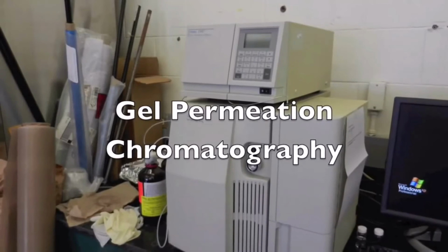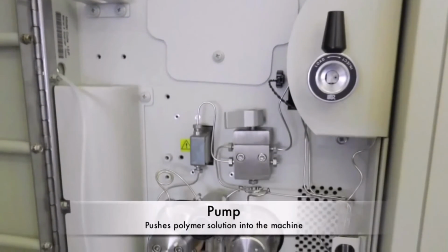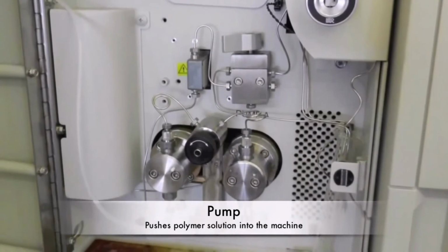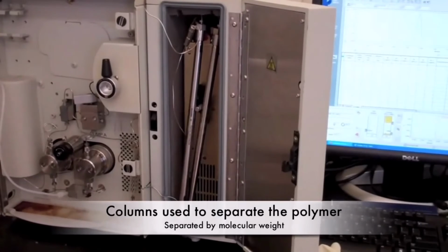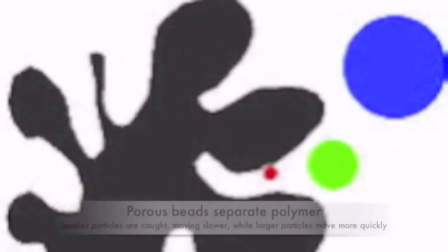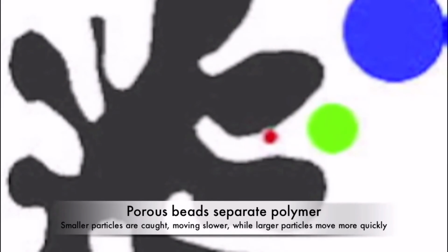Gel permeation chromatography, or GPC, is a separation method used to estimate the molecular weight distribution of polymers. The GPC has three main components. First, the pump is used to push the polymer solution and solvent, THF or tetrahydrofuran, into the machine. The second component, the columns, is used to separate the polymers depending on their molecular weight as they are pushed through the instrument. Porous beads, typically either polystyrene or glass, are usually used to separate the polymers within the columns, causing larger polymer molecules to flow through quicker. Smaller polymer molecules are caught up in the beads and diffuse more slowly.